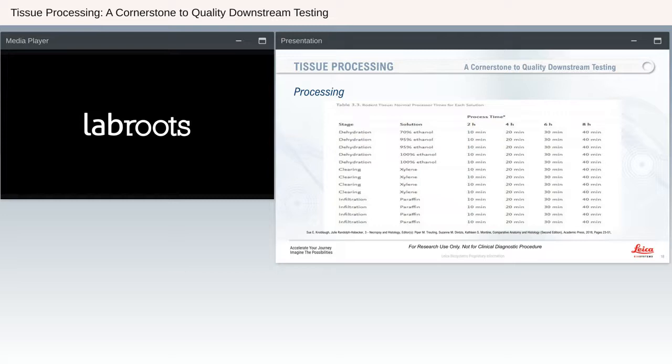temperatures or PV, but I did want to point out that it is becoming more and more common because of the molecular testing to customize protocols for tissue size, sometimes even for tissue type, especially for fatty specimens, if anybody is using those in their testing. One thing that we have been traditionally practicing in the histology laboratory is that we would take total time and just divide everything up among the steps, as you can see.